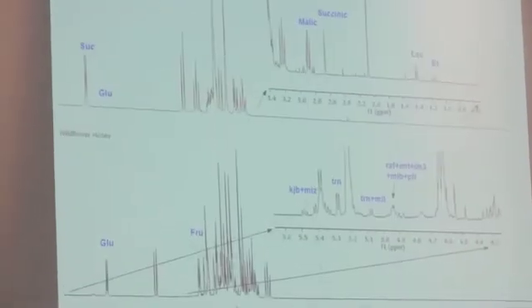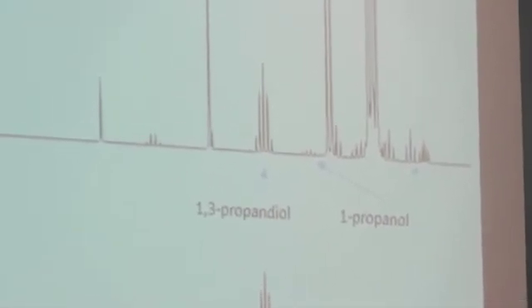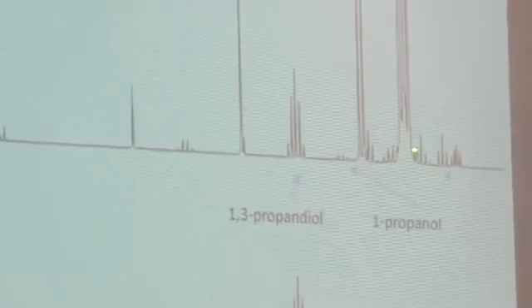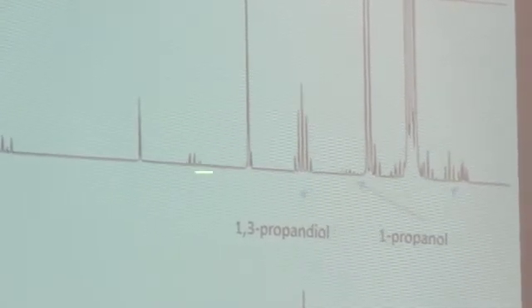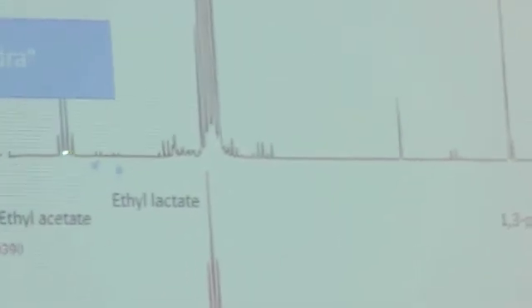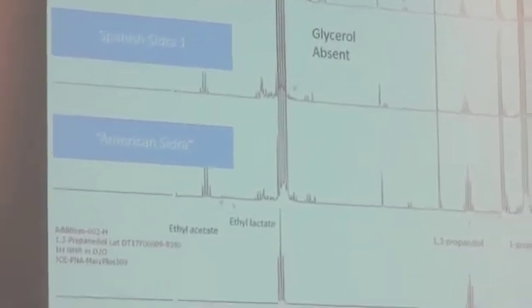And so when you go back to the Cidra, there's a triplet in here which would have lined up with that 1-propanol spectrum I showed you right at the beginning. And so you can quantify the 1-propanol. This quartet here is from the propionic acid. And then there's this triplet here to the side of the ethanol, which is the other part of that molecule. So you can kind of prove that that's really what it is. You've got ethyl acetate going on here and a lot of ethyl lactate. Ethyl acetate, there's a lot of acetic acid. So they're really, really different ciders than just regular.